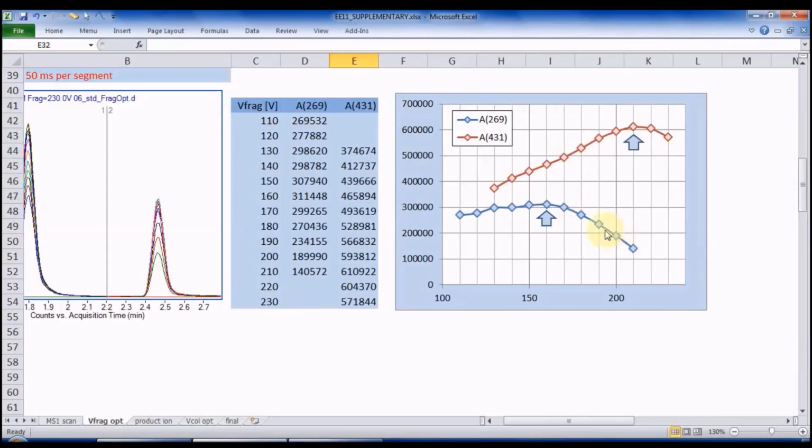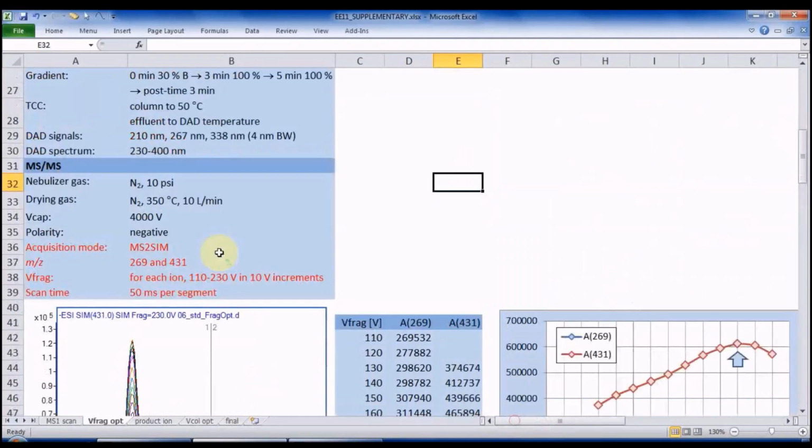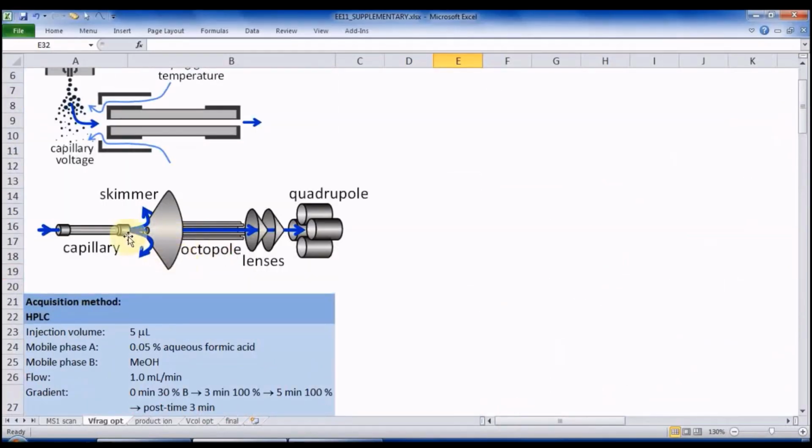Namely, as the voltage increases, the ions are accelerated to greater velocities. If the velocity is too low, the ions will easily be deflected by air molecules present in the fragmentor area and lost. At higher velocities, they will be able to push their way through and enter the high vacuum segment leading to the analyzer.